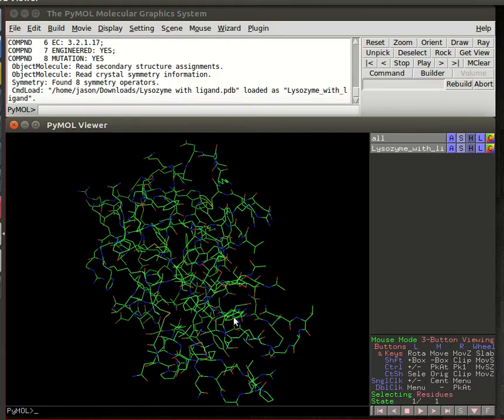So the ligand here is kind of an artificial subunit. It's a part of a peptidoglycan, pardon me. It's the NAG subunit, and it's in a repeat. So if we had opened the PDB file in a word processor, we would be able to see that the ligand is designated NAG. So all the residues inside the ligand are designated NAG.